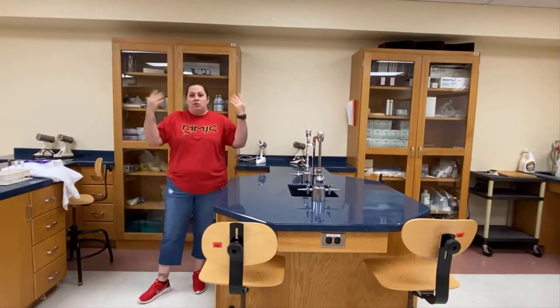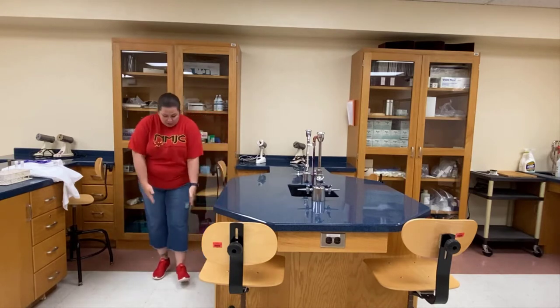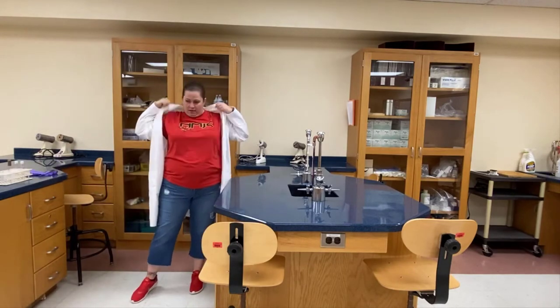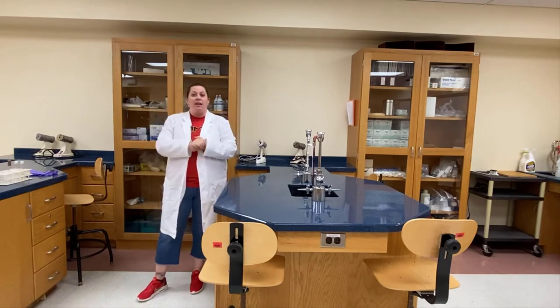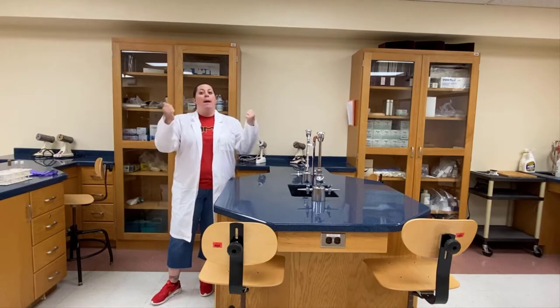Now that our hands are washed, we want to get into the proper attire. We need to make sure that we have our closed-toed shoes on — shoes that are not open-toed. We're also going to put on our lab coat, and then make sure we have our gloves on. Anytime we go to leave the room, we'll take the lab coat and gloves off and wash our hands. When we come back, we wash our hands, put the lab coat back on, and put our gloves back on.